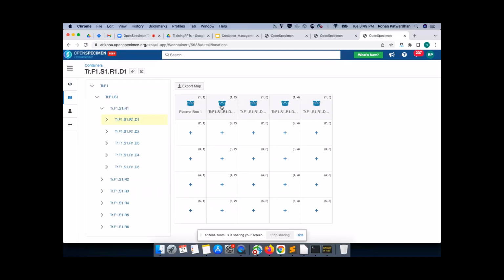So you can put the boxes wherever you want and block all the unwanted things, or remove the boxes from where you don't need. Does that help? Yes, I understand. So we'll need to just define our standard way of what we're going to call a row and a column, even as we're changing orientations a little bit through the drawers and the racks.